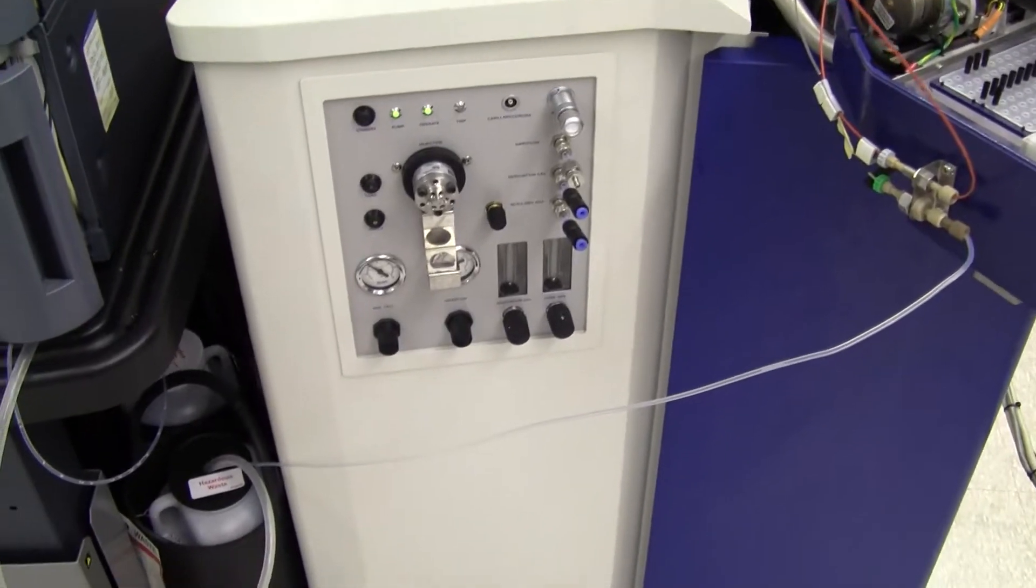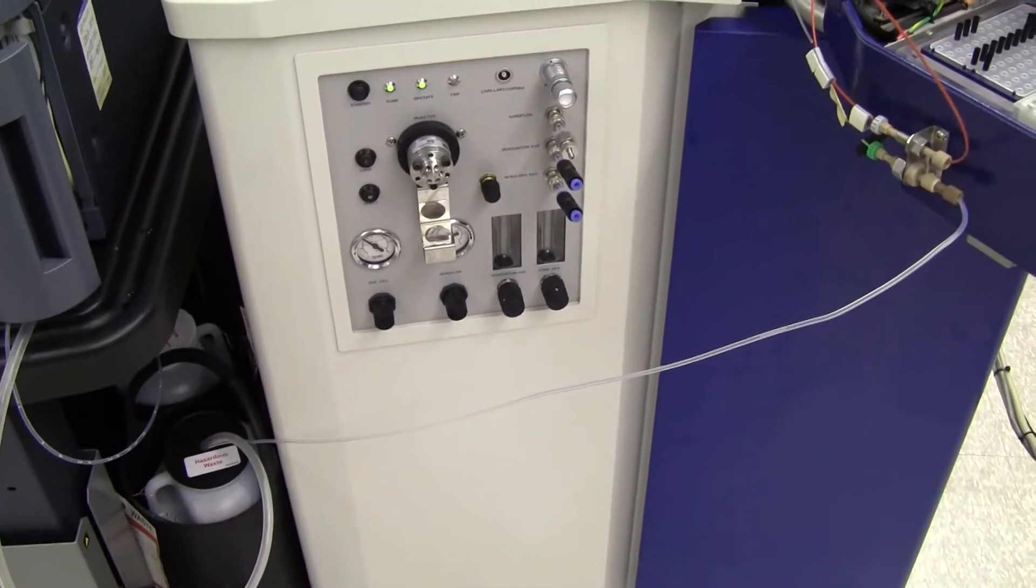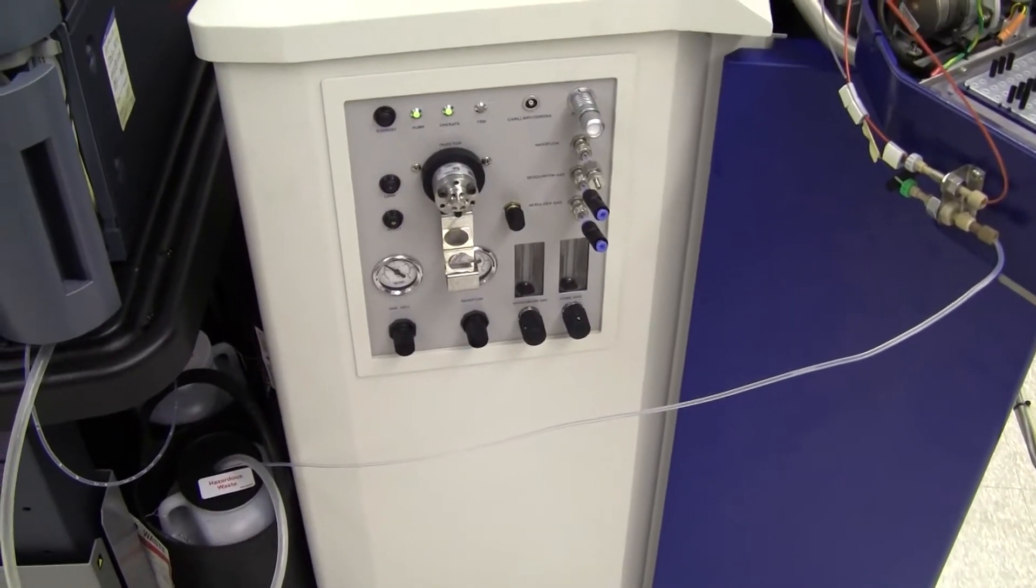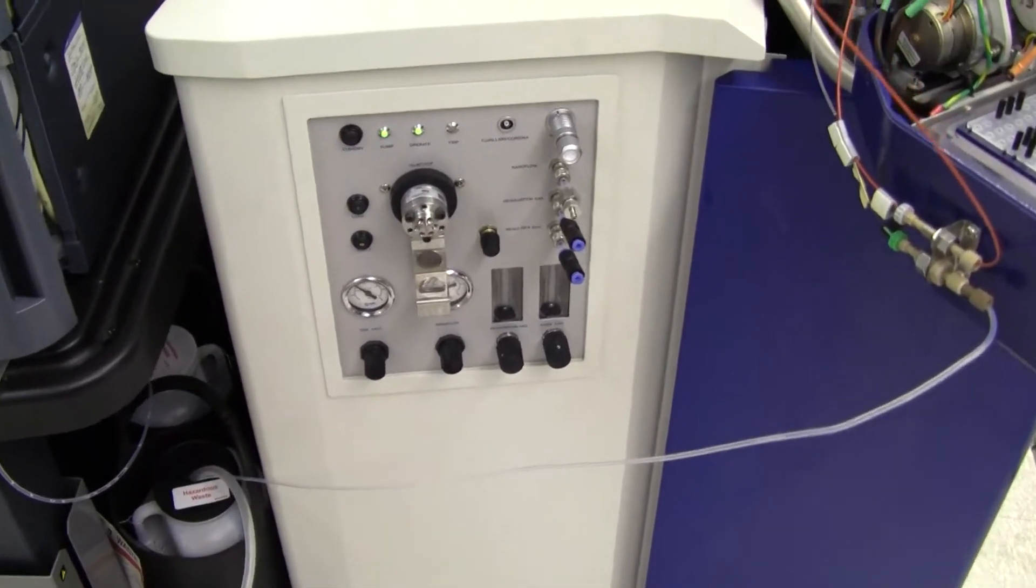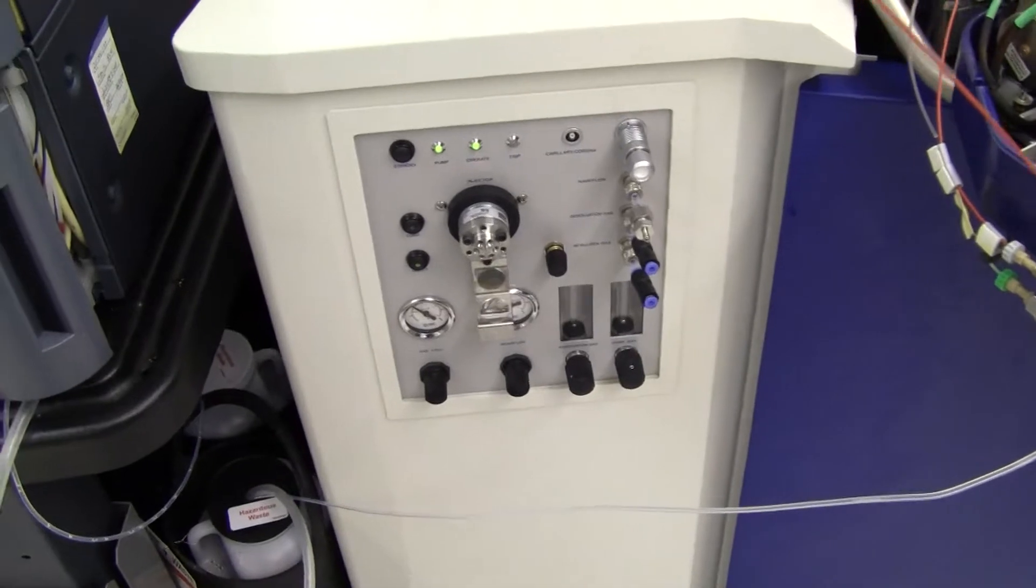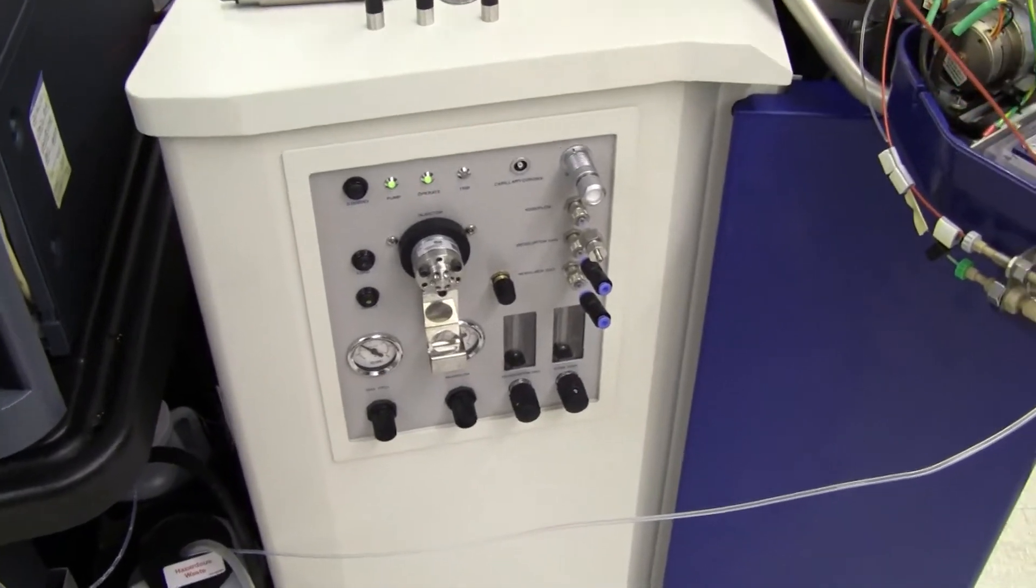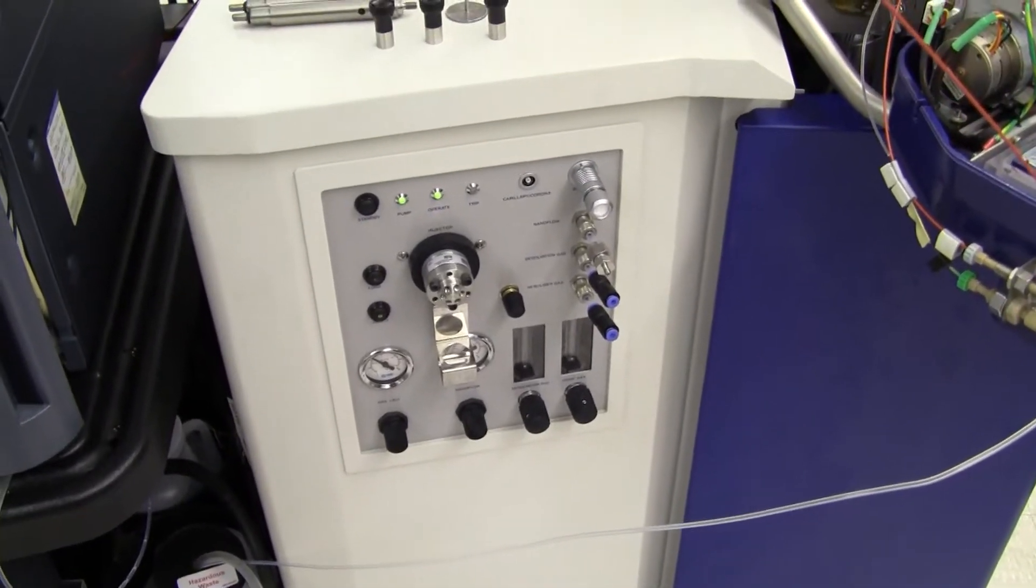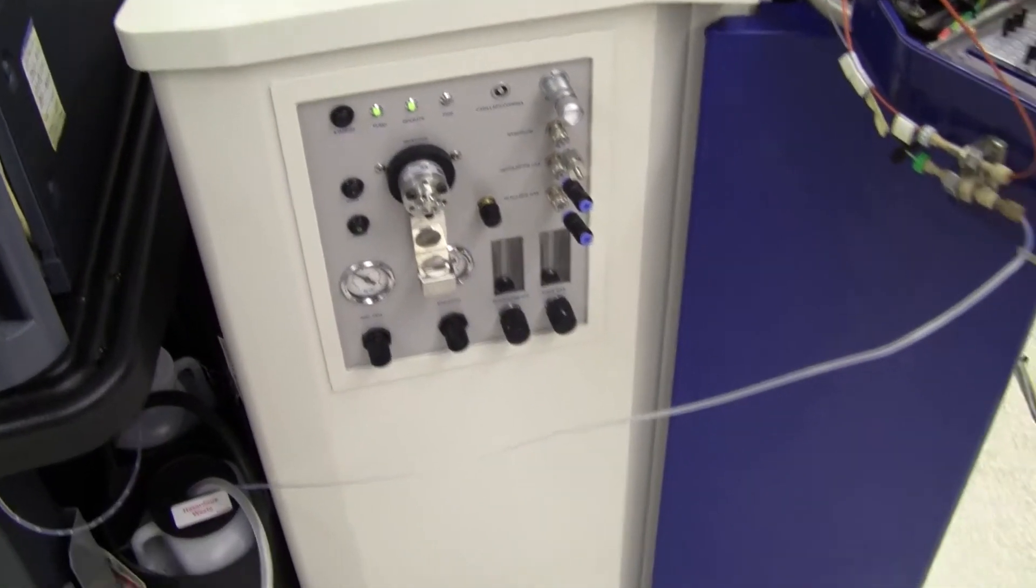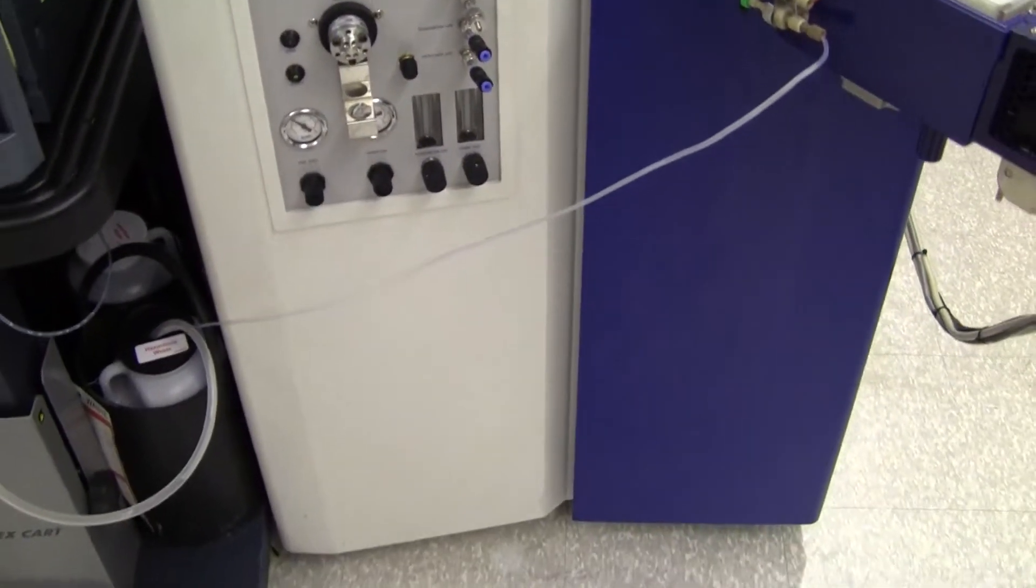Good morning, this is Michael Nadell. Today we're looking at a Micromass QTOF 2 unit that is up and functioning.